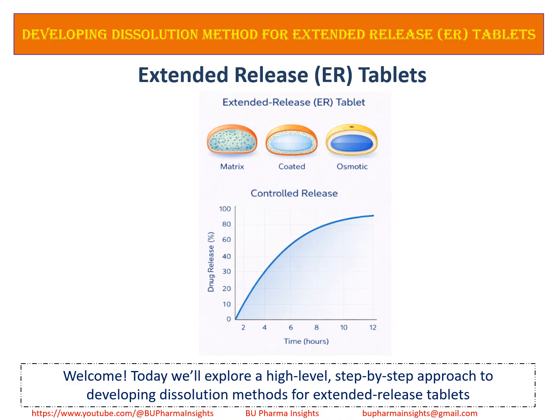Everyone. In this video, we will discuss dissolution method development for extended release, that is ER tablets. Extended release tablets are designed to release drugs slowly over 8 to 24 hours. Because of this, their dissolution method cannot be the same as immediate release products.